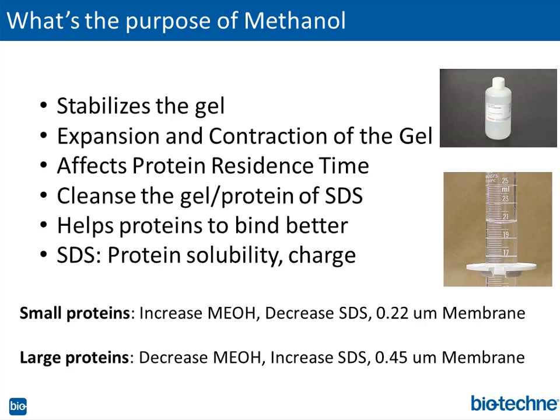And we're going to talk about membranes a little bit later and pore size, but basically to better capture a smaller protein, you want to use 0.22 membranes. The reason for that is because it's thicker and there's a greater internal surface area, like 3 times as much as 0.45. So a general rule I tell people is anything 20 kilodaltons or greater, roughly. Again, everything's trial and error, but 20 kilodaltons or greater, you want to use 0.45. There's enough size there on the protein to get good binding, but anything lower than that, if you're working with a 10 kilodalton protein, guess what? You've got to go 0.22 typically to better capture that protein. And by the way, with 0.22 membranes, you typically get higher background. We're going to talk about that a little bit later.